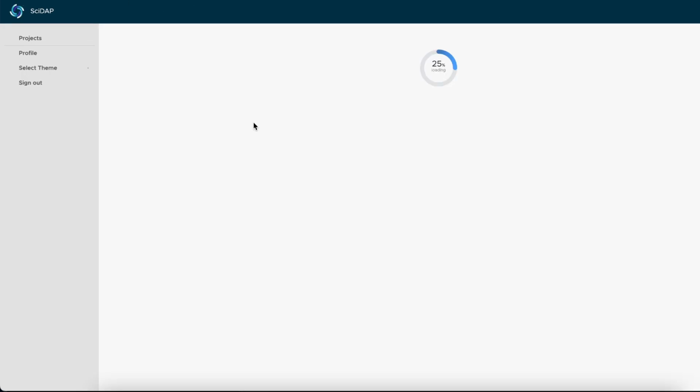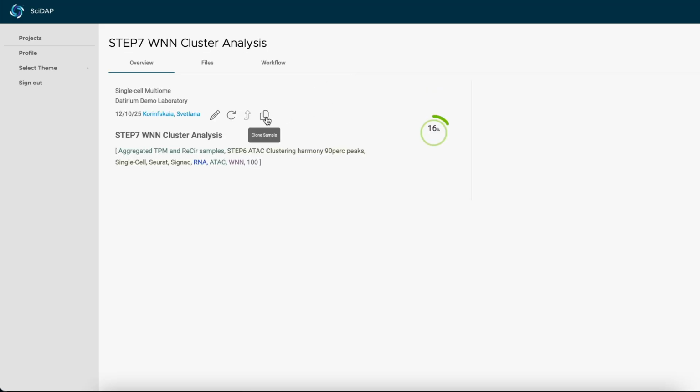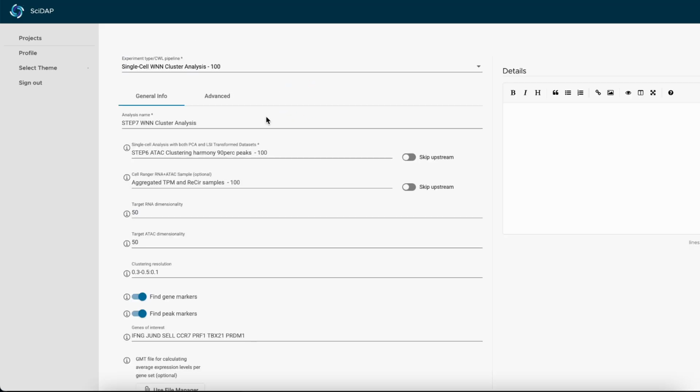Remember we had some issues with the silhouette scores in ATAC? I think it would be reasonable to try giving the ATAC part less contribution and rely mostly on the RNA part for the generation of the final WNN UMAP.